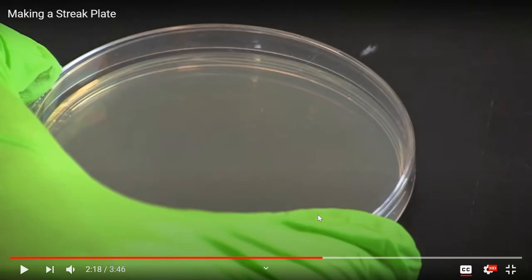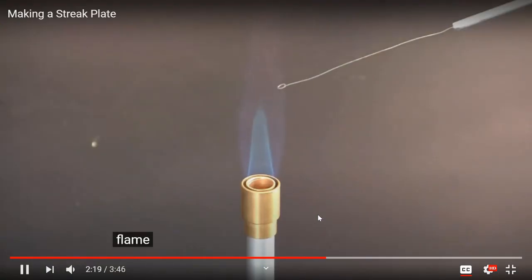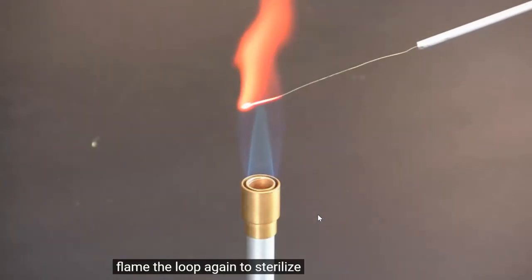And what you're going to notice after he flames his loop, he's going to rotate the plate again 1/4 turn. He's going to drag the loop into zone 2 a few times and then stay out of it and spread out those bacteria. Flame the loop again to sterilize.